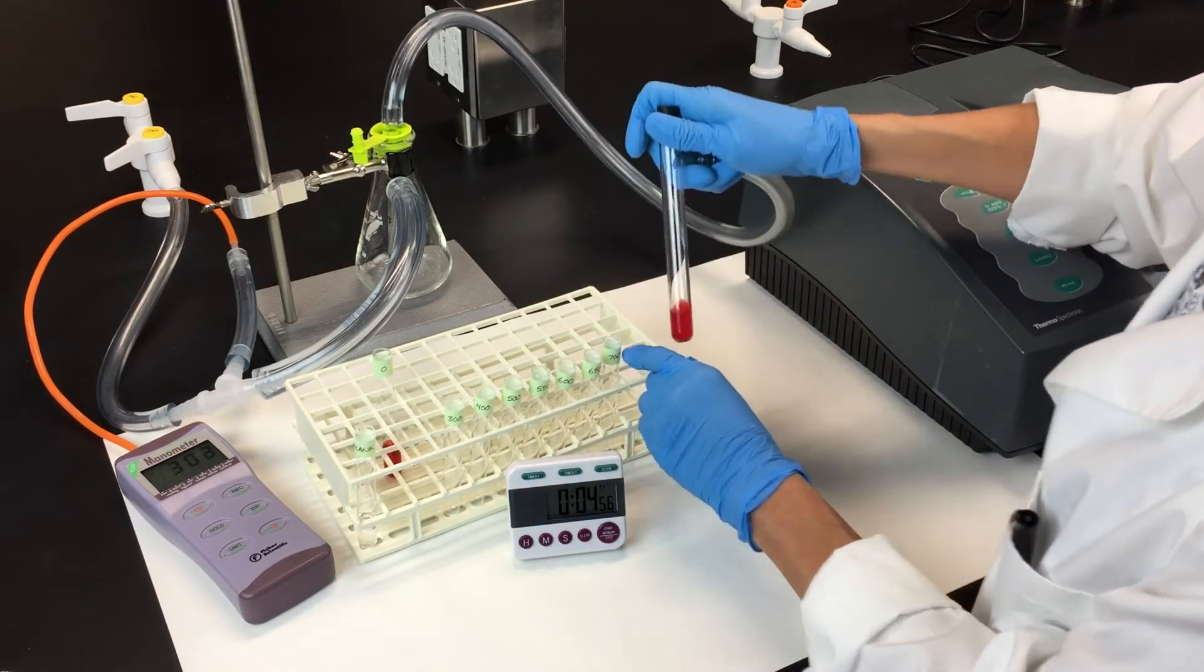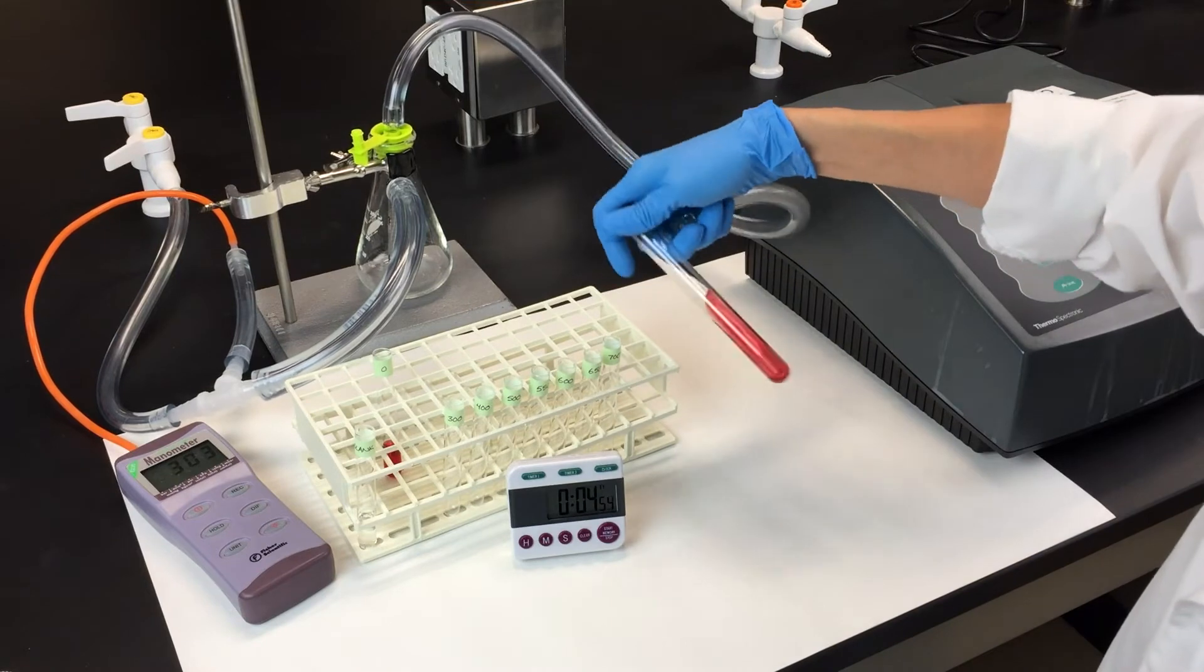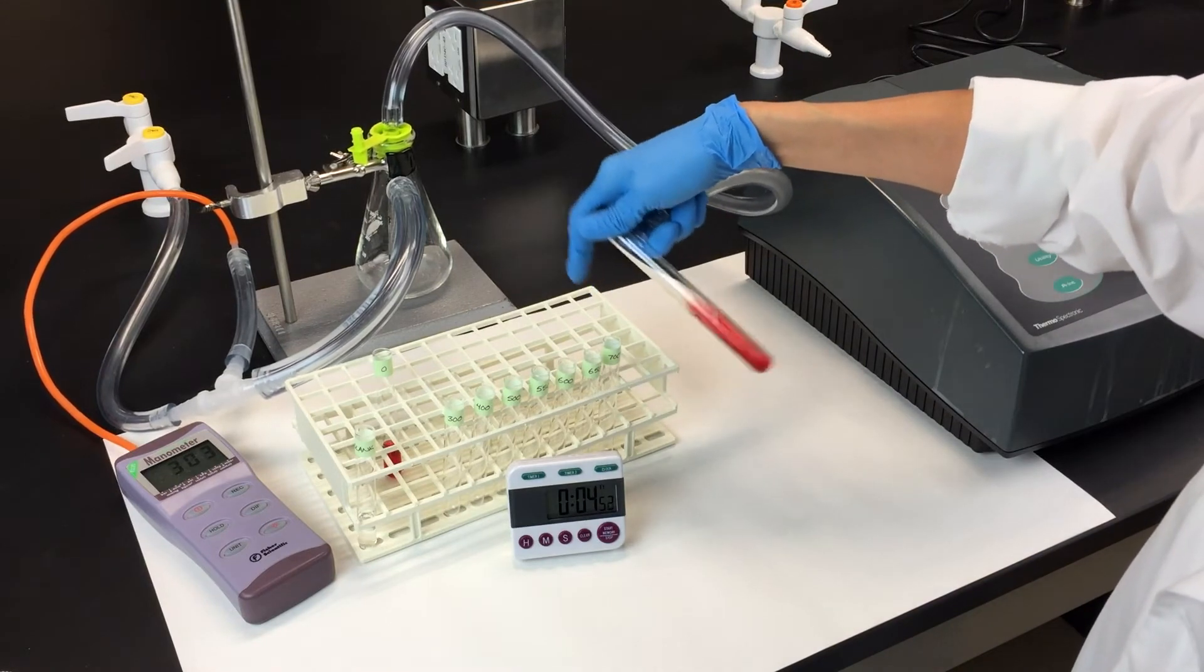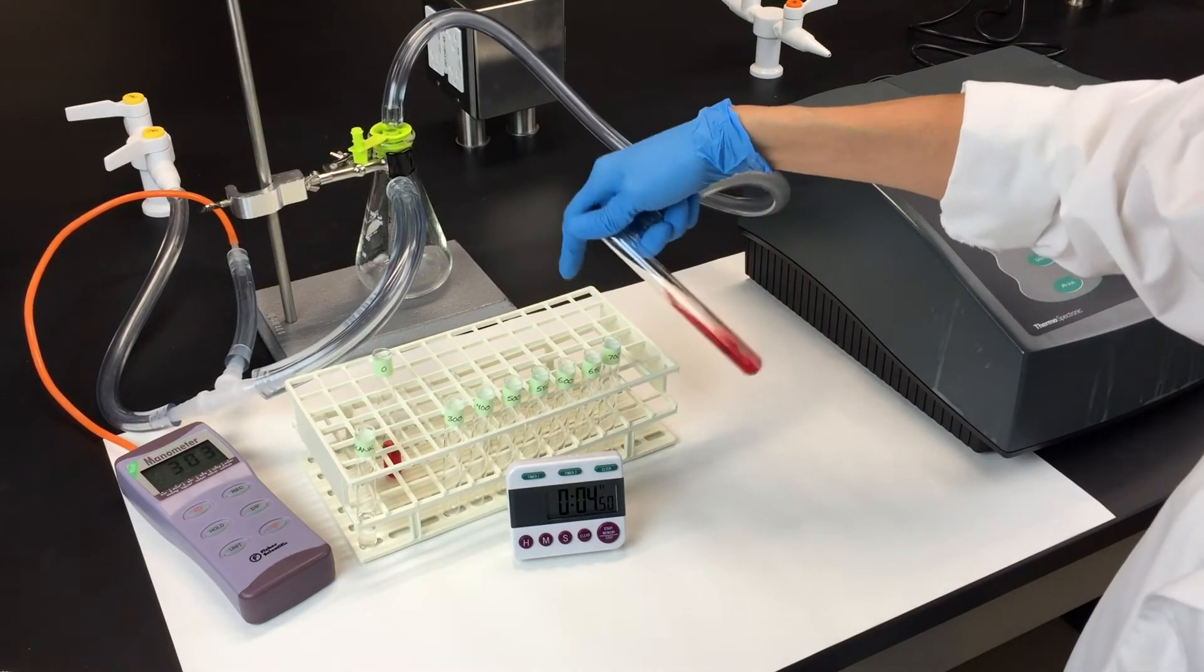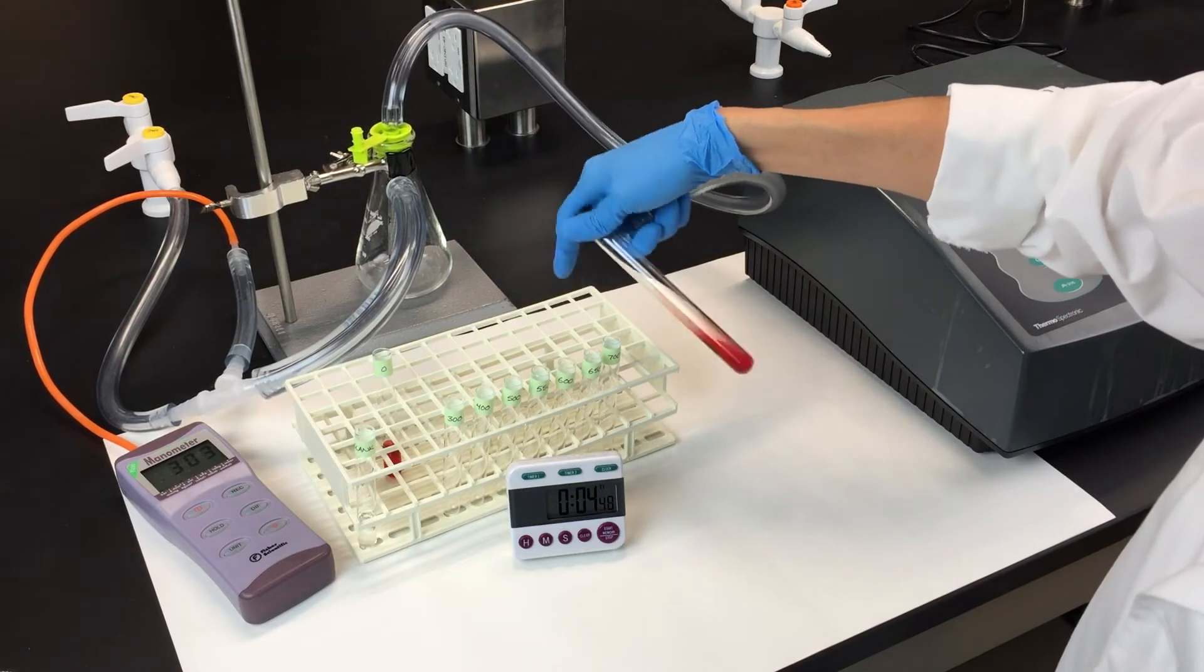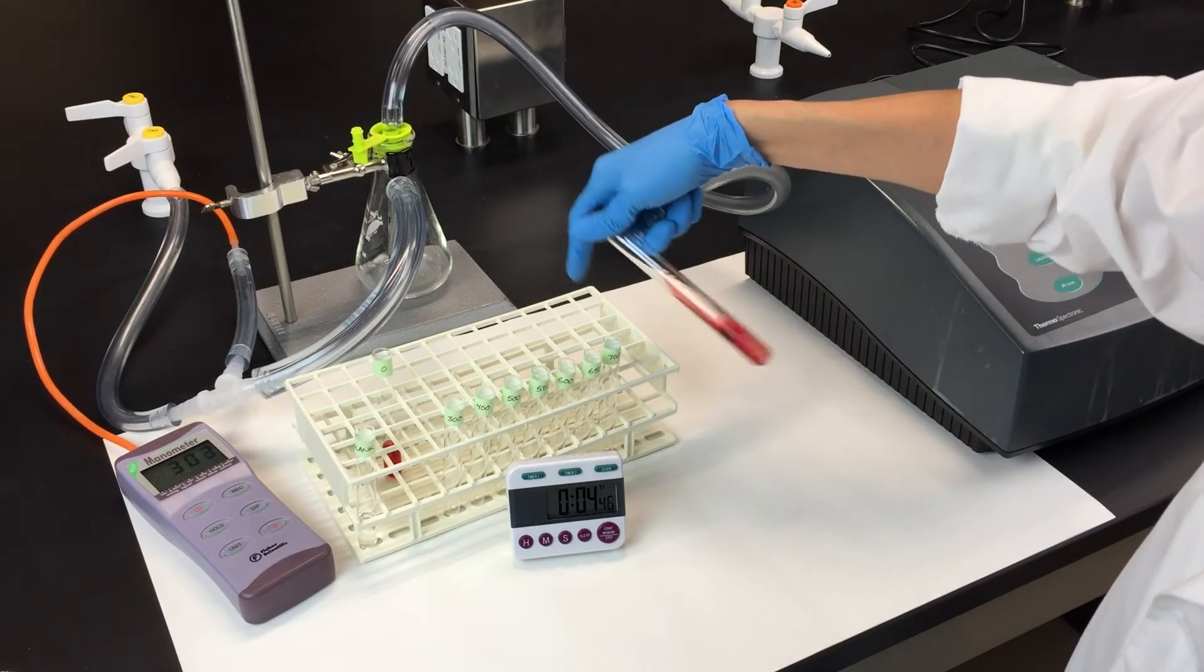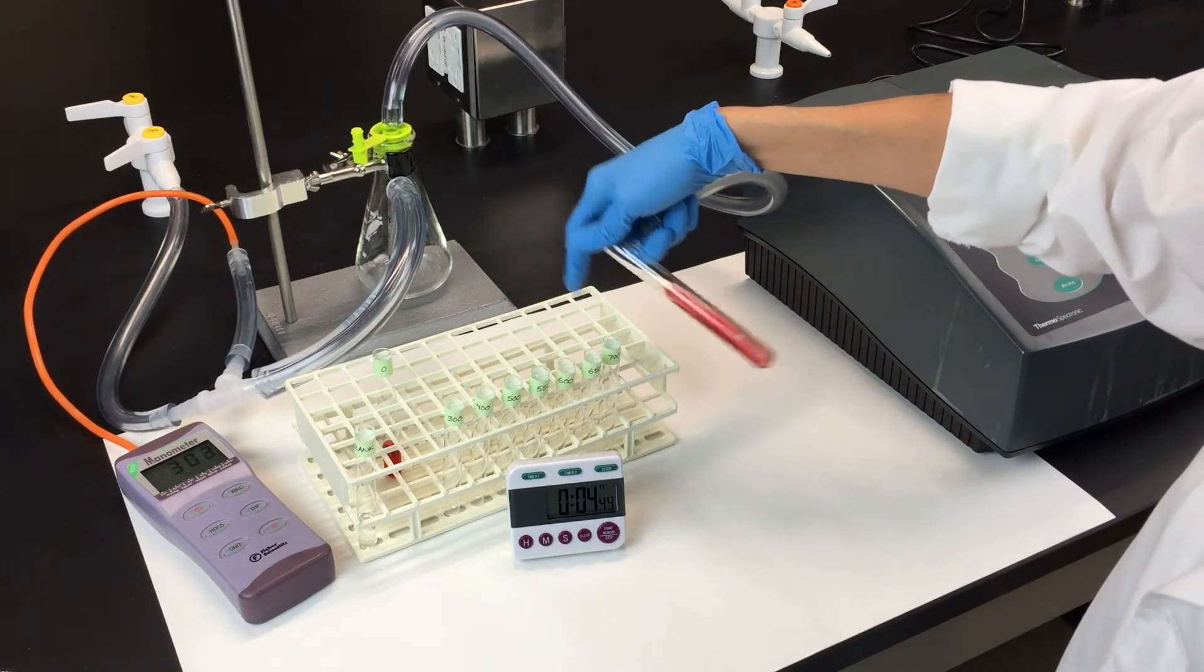Pick up the sidearm tube, tilt it, and begin shaking it at a steady rate. You want to expose as much of the hemolysate to the vacuum as possible. You also want to be careful not to get the hemolysate in the vacuum tubing.